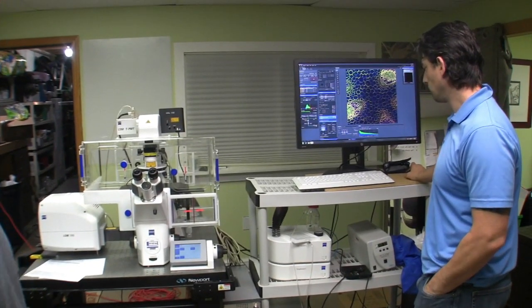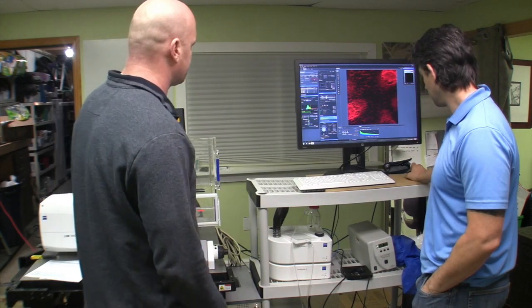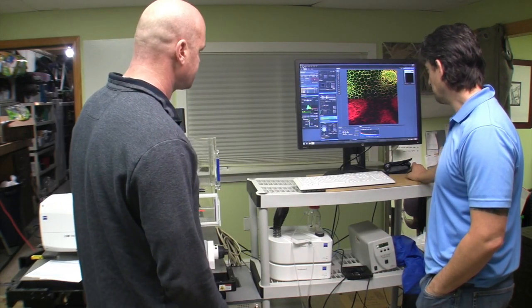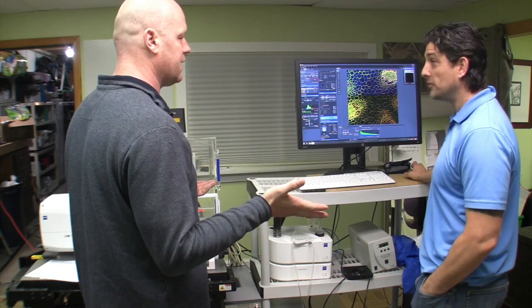It runs the experiment for you. That's really fascinating. And so you can probably see things live and die.